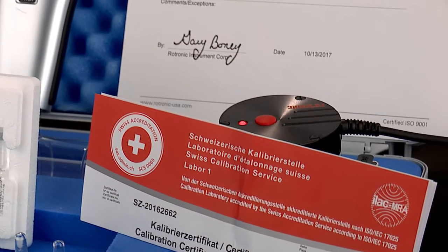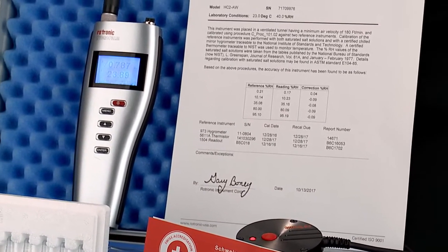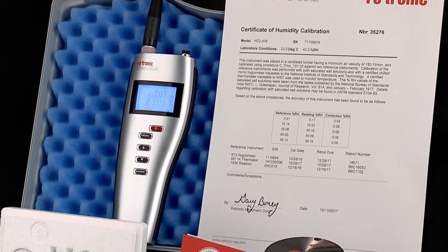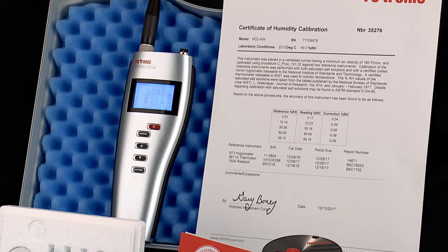When purchased, each AW probe is freshly calibrated and a calibration certificate is included. However, if all of the desired AW tests are at similar points, it is acceptable practice to simply bracket the test point with two calibration points. This all depends on the SOPs of your organization.